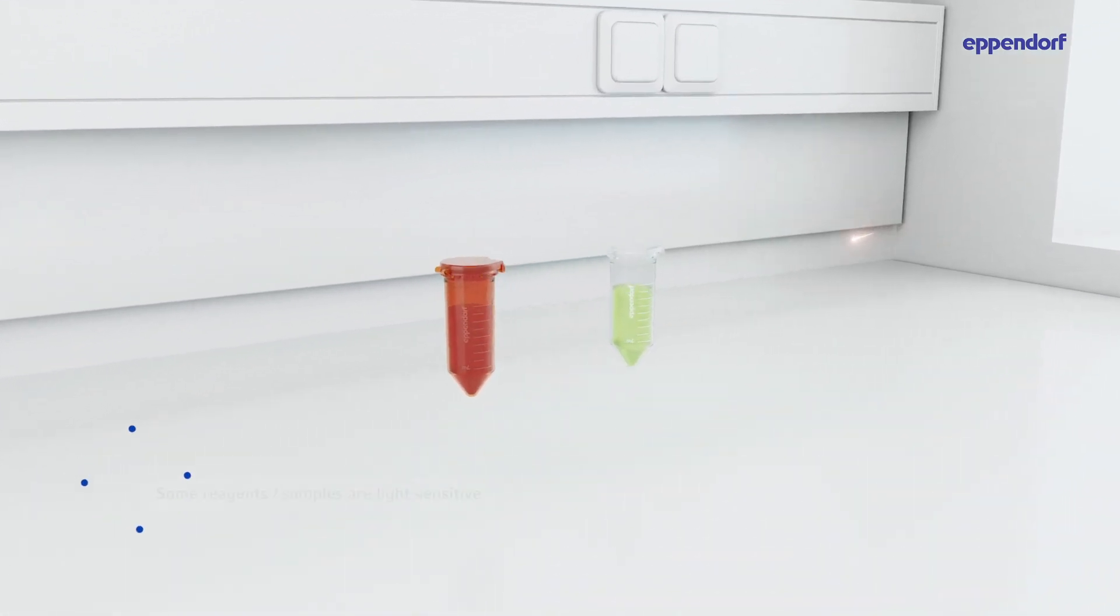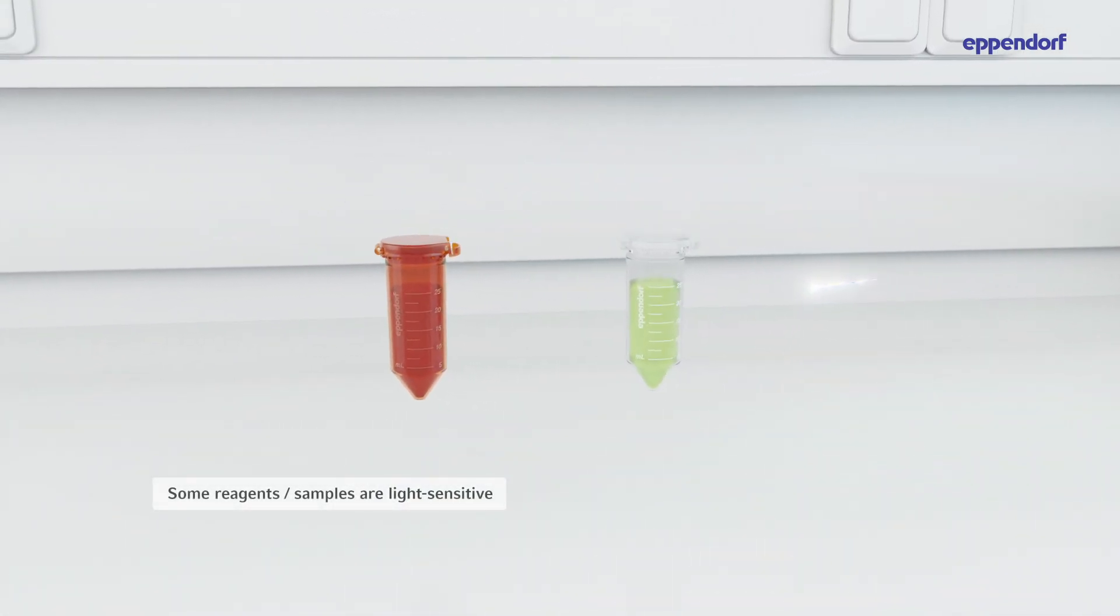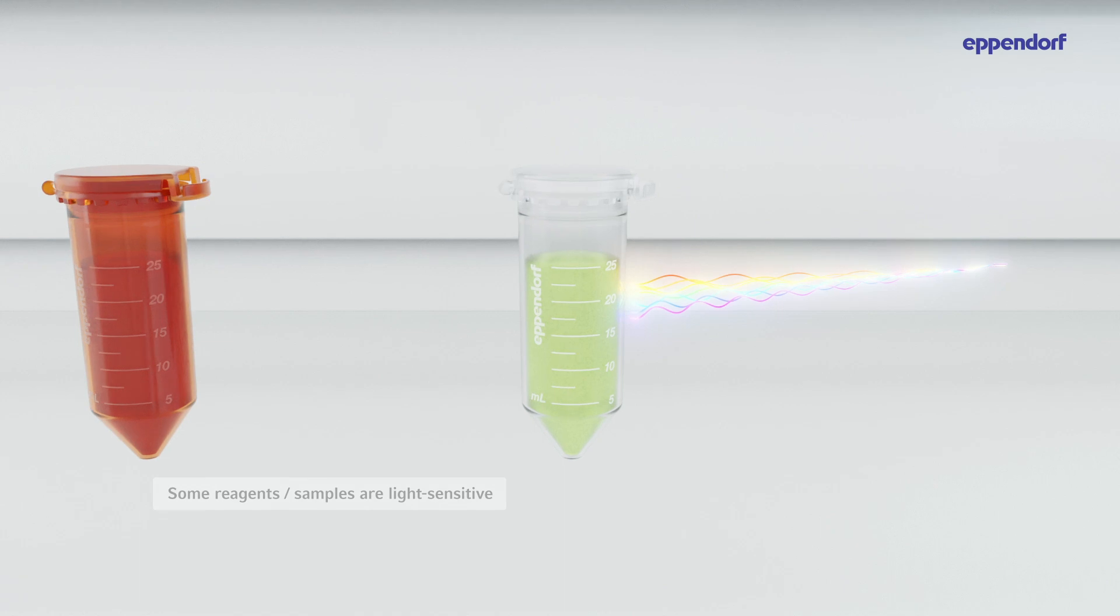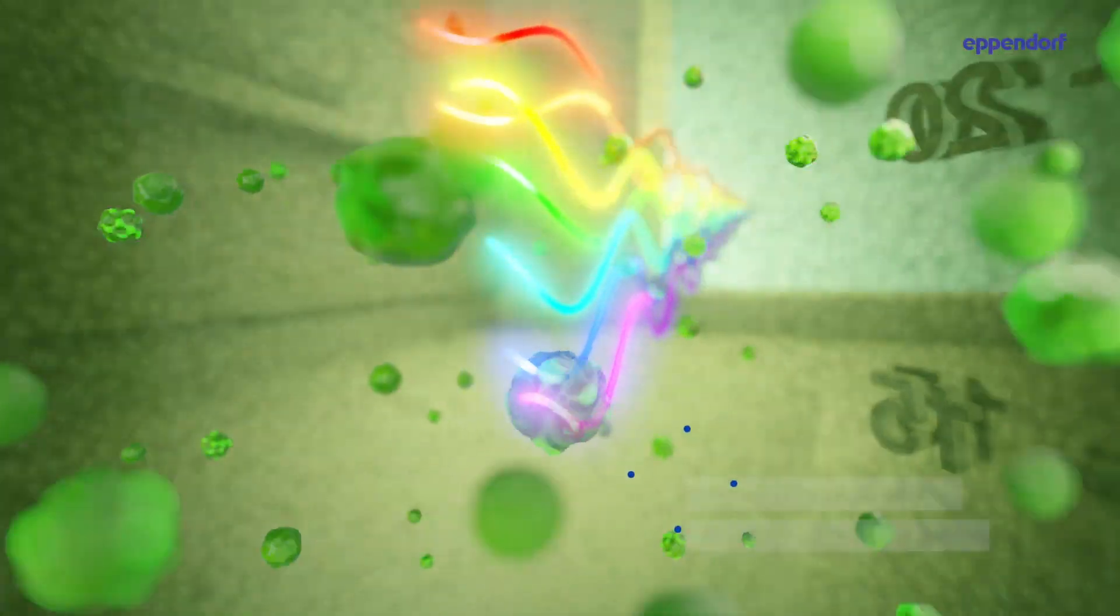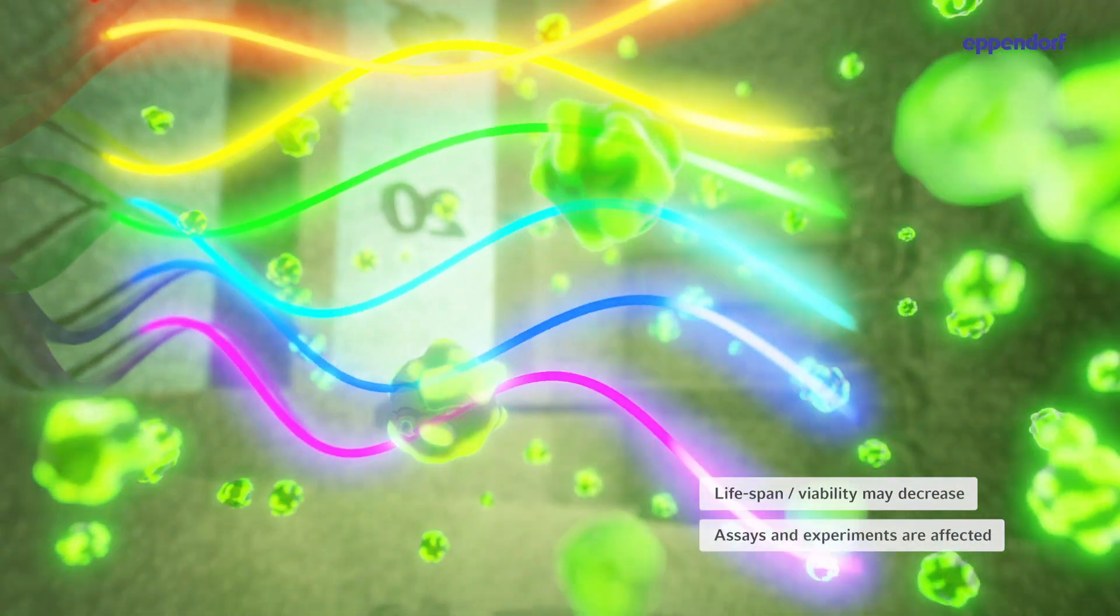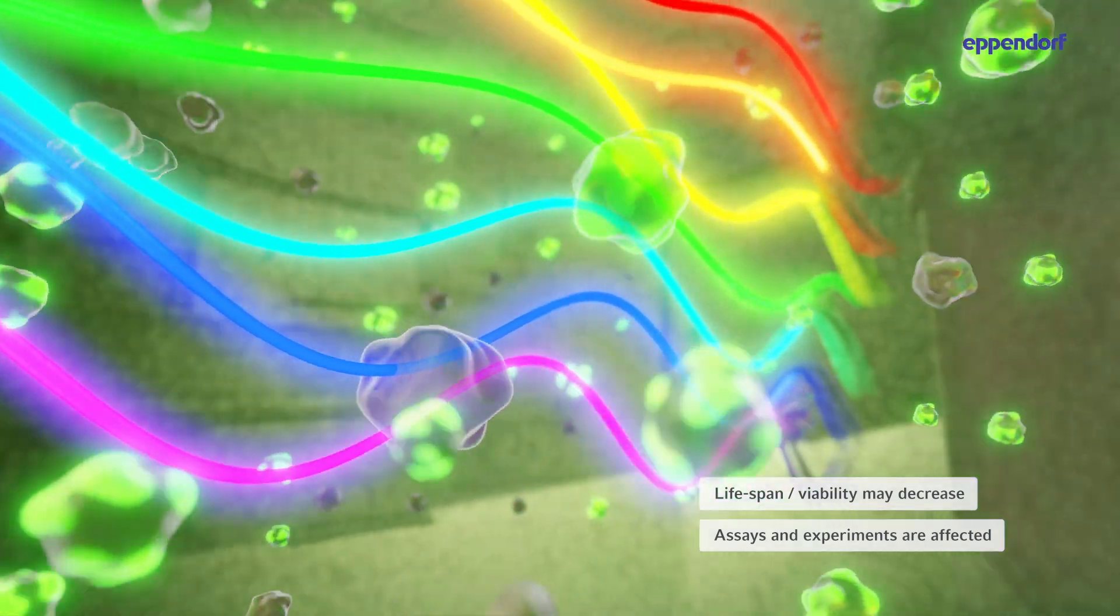Numerous types of light-sensitive reagents and samples are often used in the laboratory workflow. Once exposed to light, their lifespan or viability may rapidly decrease and thereby adversely affect various assay systems.